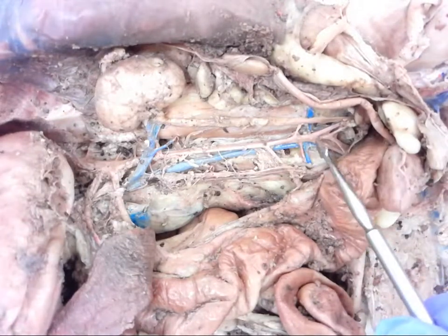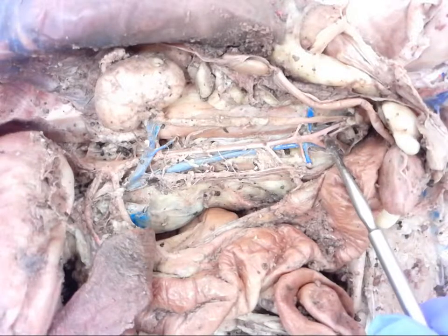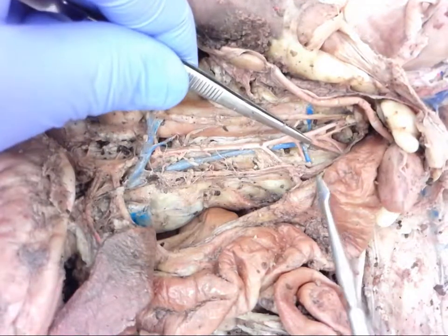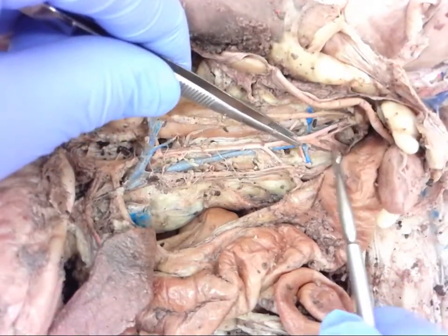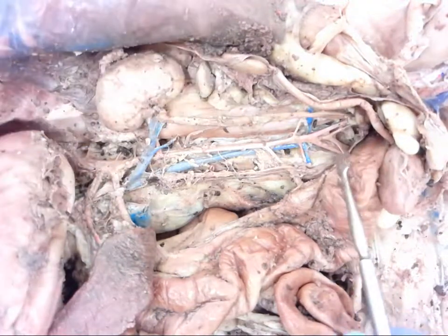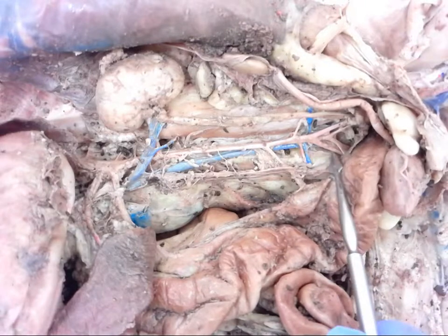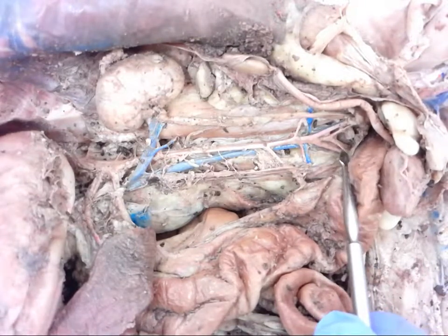We'll see a split here as it heads down to the leg. I'll get my spear out of the way, and you can see a fairly good split, and there's one that goes down the middle and then it splits again. So these are going to be our external iliac arteries and our internal iliac arteries.